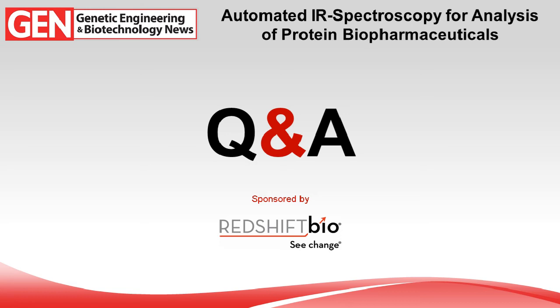All right, everyone. Thanks for joining us for the Q&A session. We have a bunch of questions for our panelists here. The first one's going to go to Dave. Dave, one of our audience members would like to know how much optimization of the parameters is needed before measuring each sample or spectrum, and for each sample set?